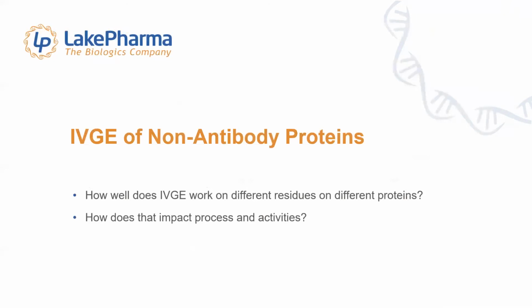Here, we examine how IVGE works on different residues on different proteins, and also look at how IVGE impacts the processes and activities. We can only, at this point, show a limited amount of data because a lot of the work is either in progress or cannot be shared at the moment.